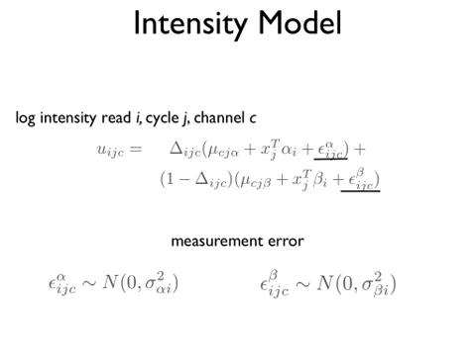There's not that many statisticians left in the room, but it's the delta triangles. If delta for ij, C equals A is 1, that means that's an A. The ith read at the jth cycle, for base C, if that's 1, then it's called an A. So by estimating those deltas, we will estimate the base call.